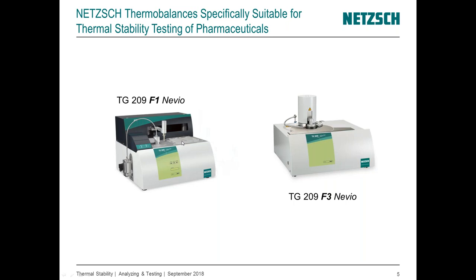Our TG 209 F1 Nevio has two magazines for samples because it features automatic sample changing — you can see the gripper here. The balance is underneath, and the furnace is in this position with its cover removed for sample exchange. There is another balance system, the TG 209 F3 Nevio, which is a workhorse for applications up to 1000°C, whereas the TG 209 F1 goes up to 1100°C, which is far enough for organic matter, food, polymers, and pharmaceutical applications.